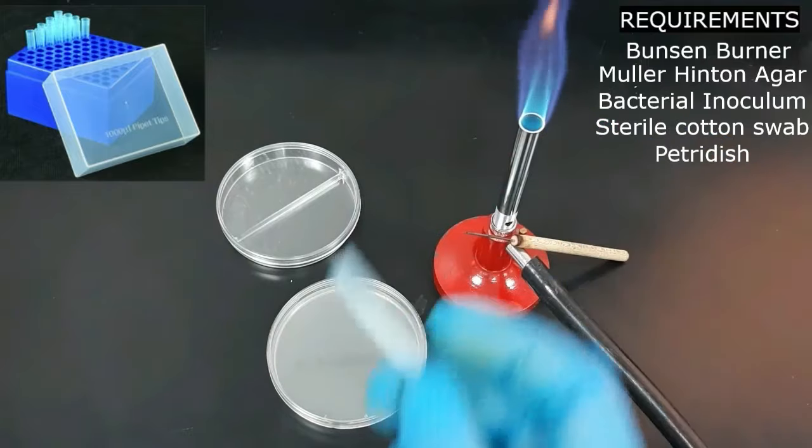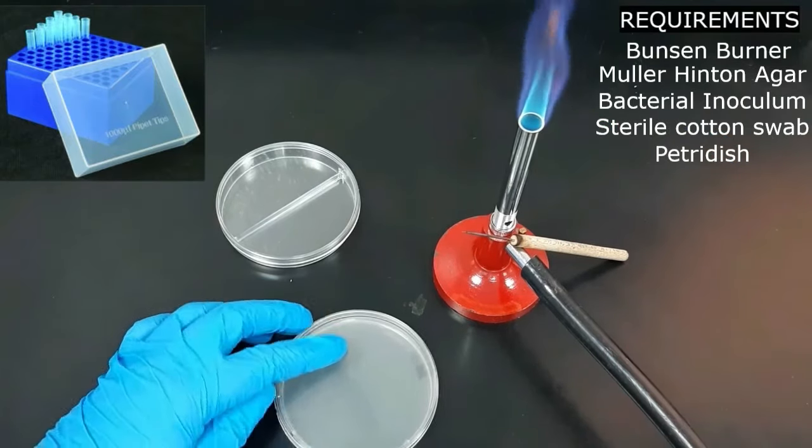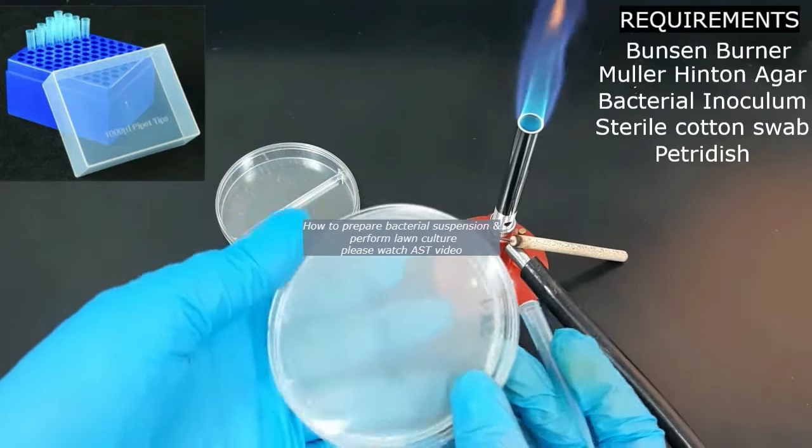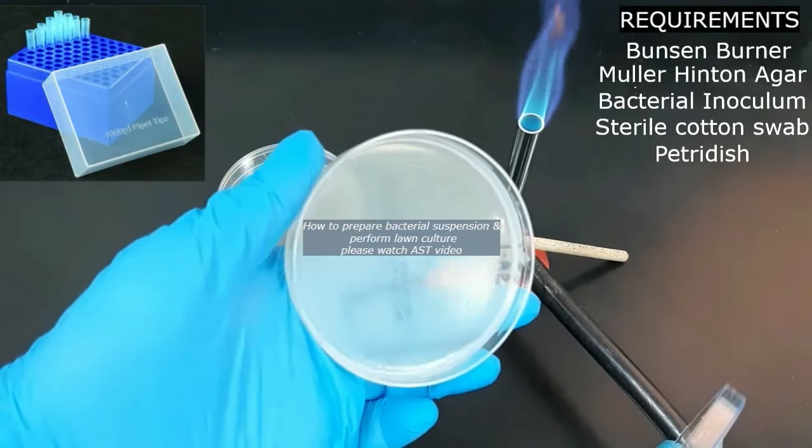Let's start the procedure. First, inoculate the bacterial suspension into Muller Hinton agar by lawn culture method. You can see here this plate is already inoculated with the bacteria.